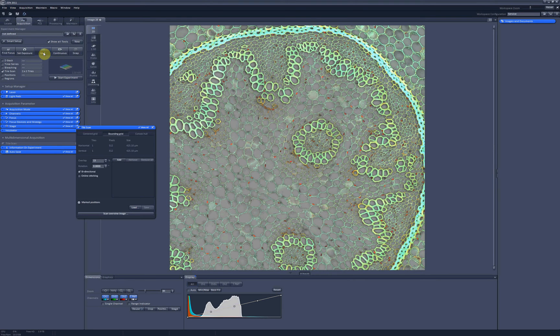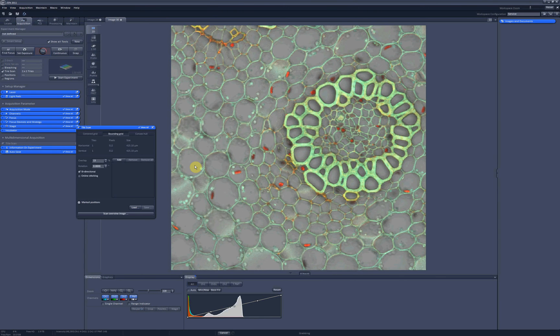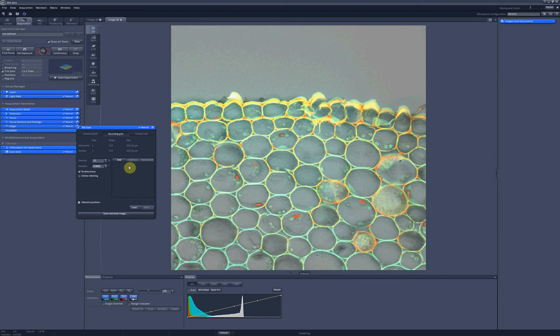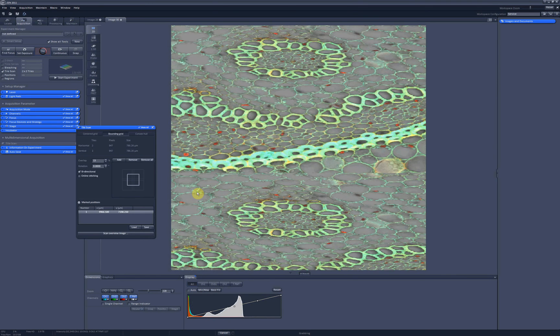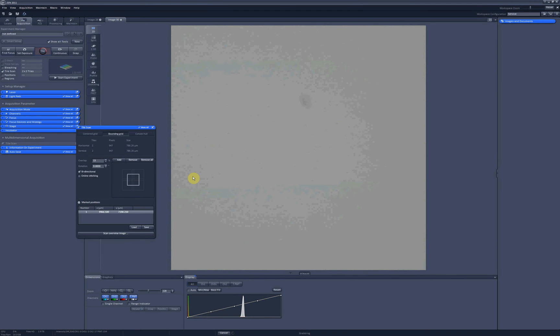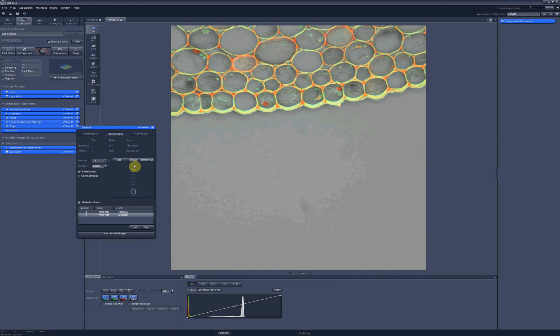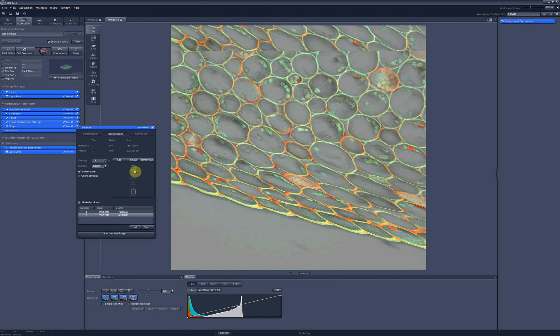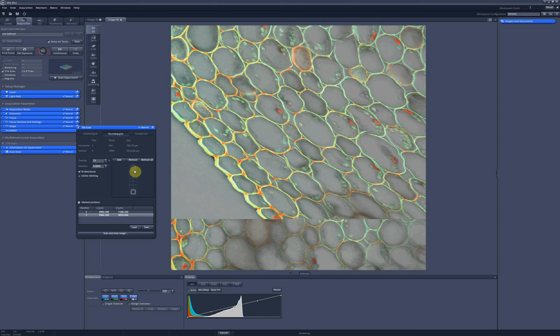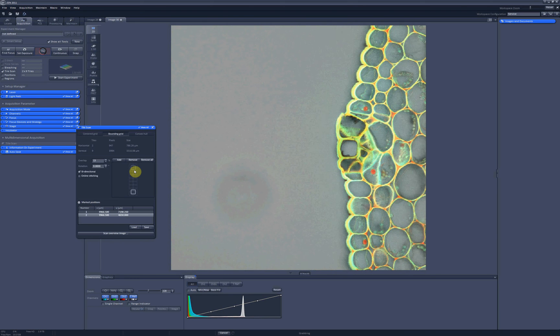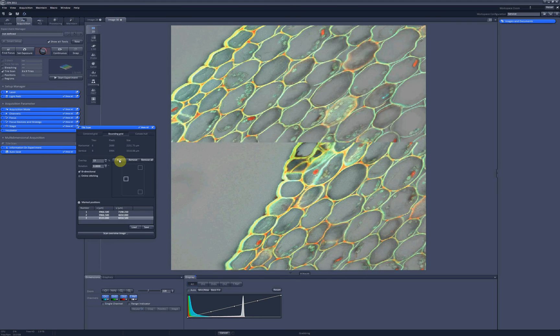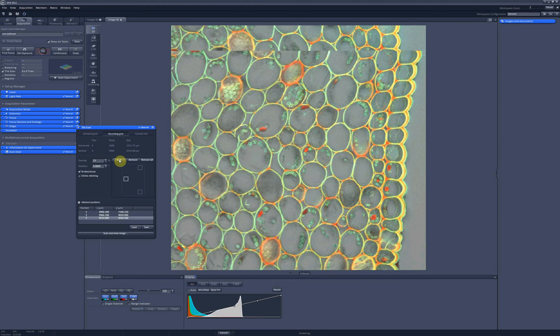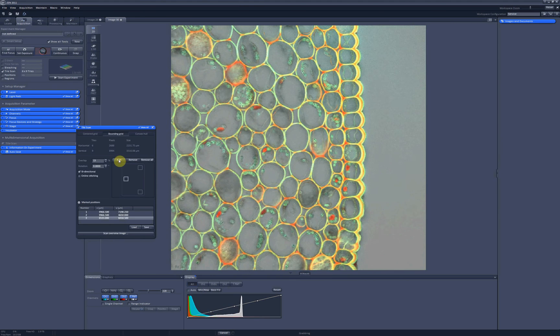So if I click on live and go to the very top of my sample and add this position, and then move to the very bottom of my sample. Now I define the top and the bottom of my scanning area, and I will do the same with the left and the right. This will be left and this will be right.